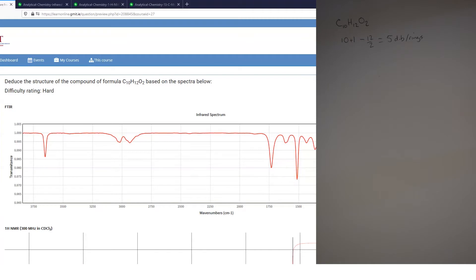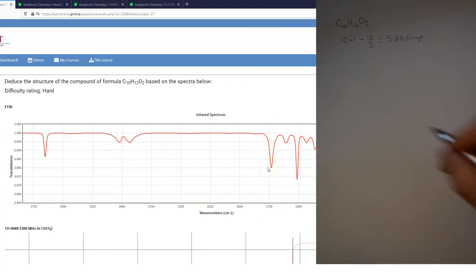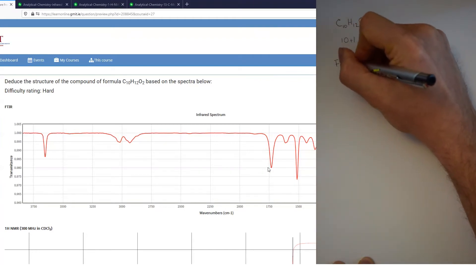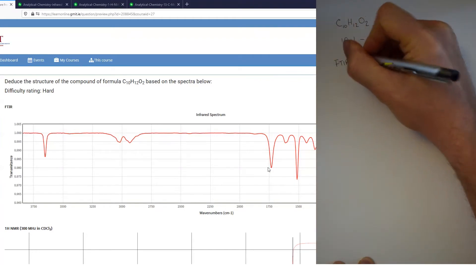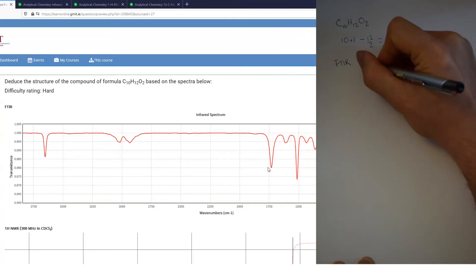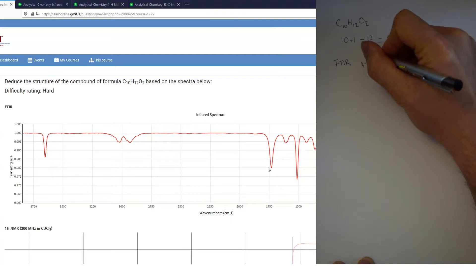Moving on to the IR: there are some peaks in the fingerprint region which we can ignore. There is a peak at around 1700, always a place of interest, and that tells us that there is a carbonyl. So from our FTIR we can deduce that our molecule contains a carbonyl.